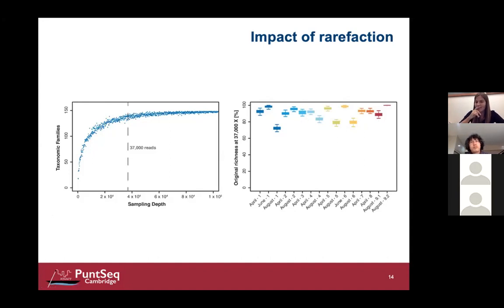And now you might ask, why don't you just set the threshold of the reads higher, so that we can actually maintain more reads? The problem is all the samples that have less than this number of reads, we have to throw out. So we basically want to find a threshold where we can maintain as many reads as possible across the samples, because by throwing whole samples out, we are obviously also going to lose reads.